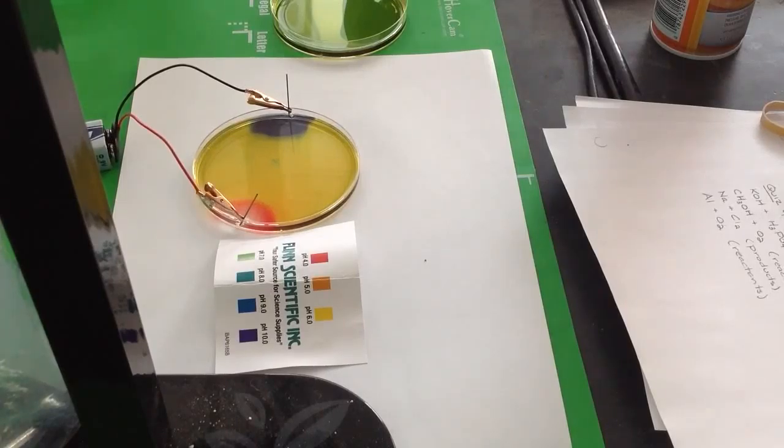So they are both decomposition reactions, but they're different. And you're seeing some bubbling at both now. Okay, I'll label this for you. This is the cathode, right here. At the cathode, why is it making this? It's doing this reaction right here. This is the anode, which is doing this reaction right here. Now, tell me why they changed the colors they did.